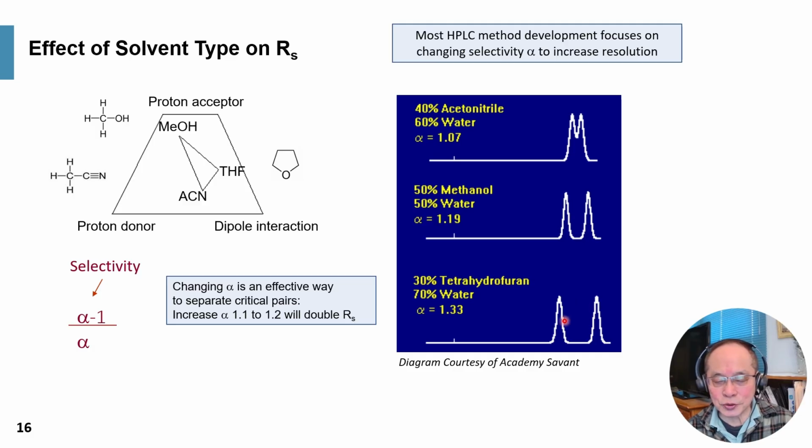It's actually too good, right? Because typically one doesn't need a resolution better than 3. So if something is resolved too much, then you should use a shorter column. This is kind of a waste of resources if resolved by more than 3 or 4 or 5.